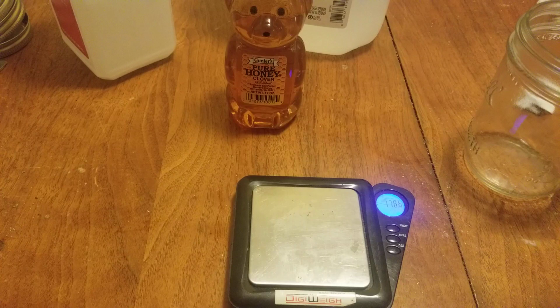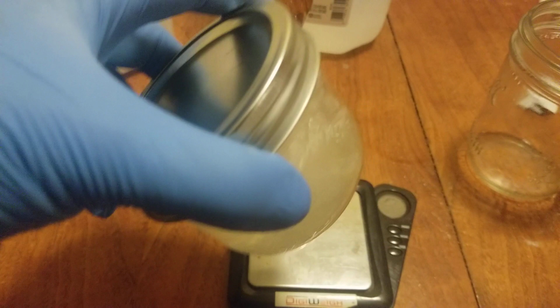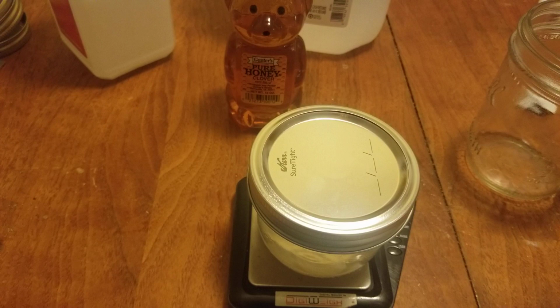So now that we got this nicely shaken up, next step is to pressure cook. You're going to want to pressure cook this at 15 PSI for about 15 minutes. So it doesn't take long. It's not nearly as long as making substrate for your mushrooms or anything like that.